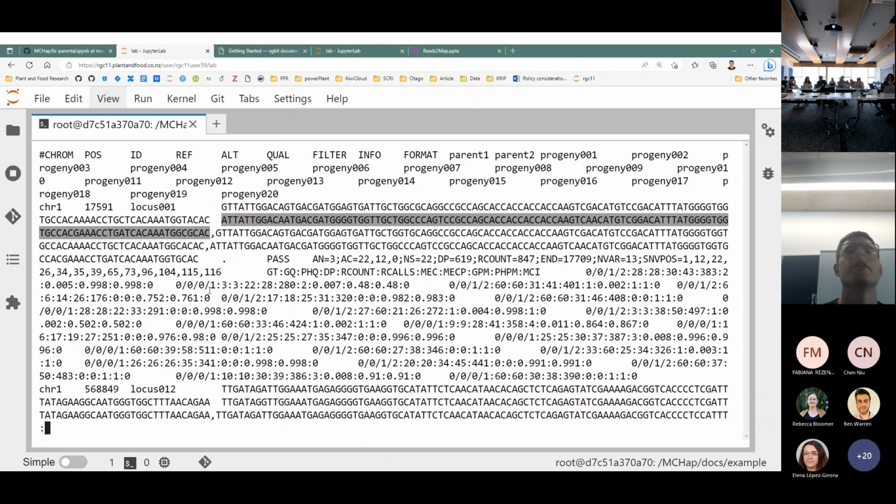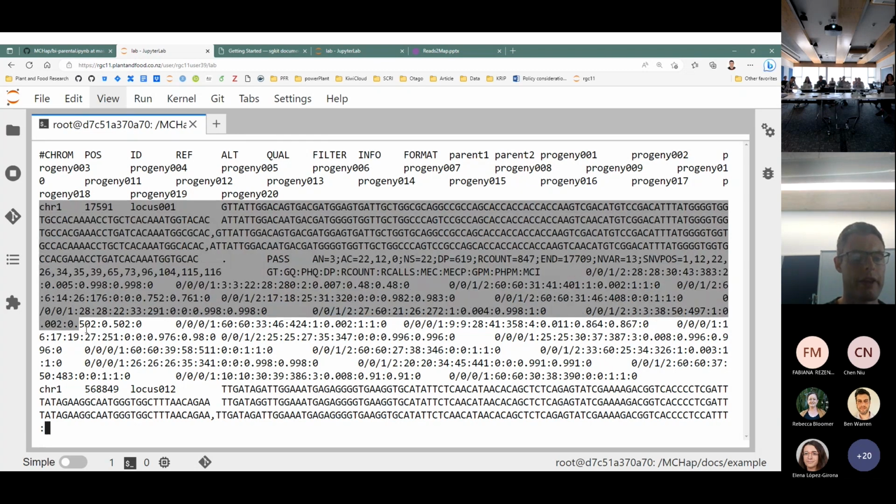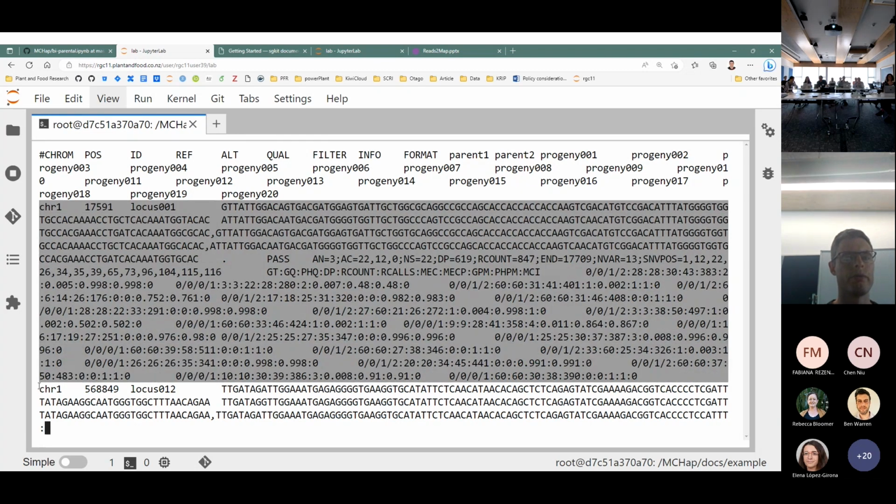So, Tim, each row is one haplotype? Yeah, it's wrapping around here because I don't have much room on my screen, but all of that there is a single line in the VCF file. And so the variant starts with the location of it: chromosome 1, the start position of the record. And in this case, we have the locus name because we had that in our bed file at the start. That's the advantage of having that optional locus name in the bed file, it will be included.